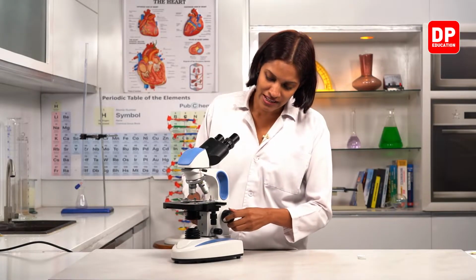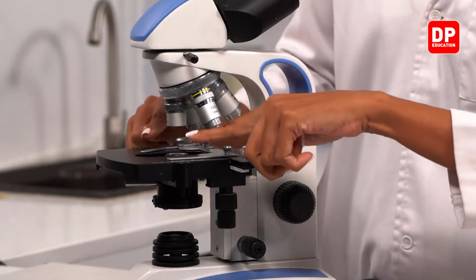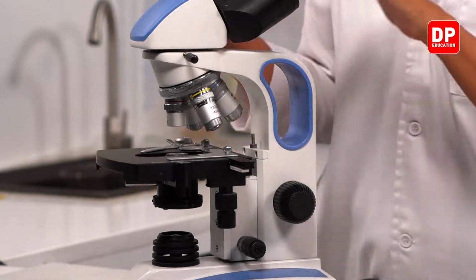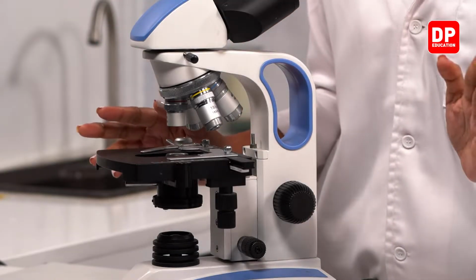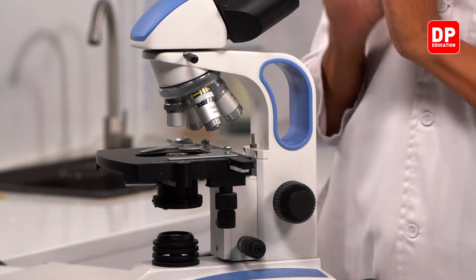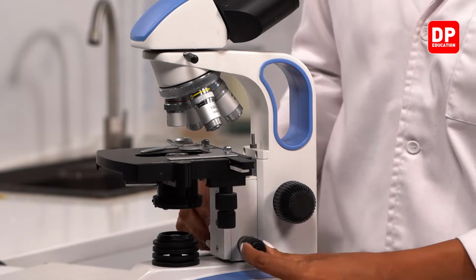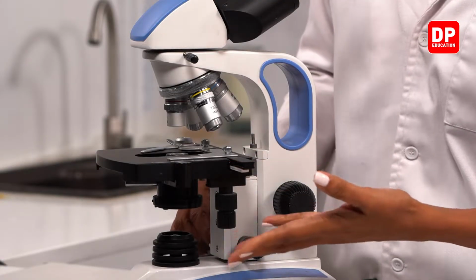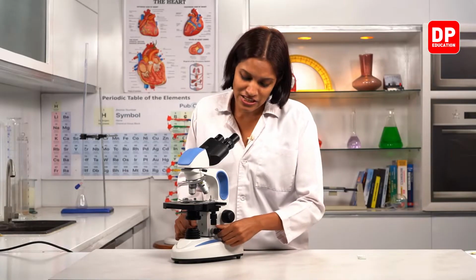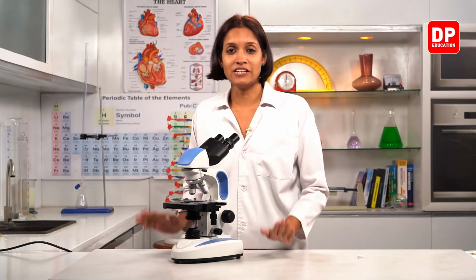Here in this modern microscope, when we rotate this coarse adjustment knob, what happens, children? This stage moves up and down. But in the basic microscope, what happens? This body tube moves up and down. Right, children? What is this small one? You can't see. Even though when I rotate this one, you can't see any change, this distance is finely changing.